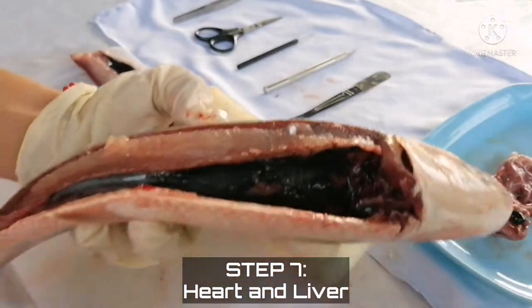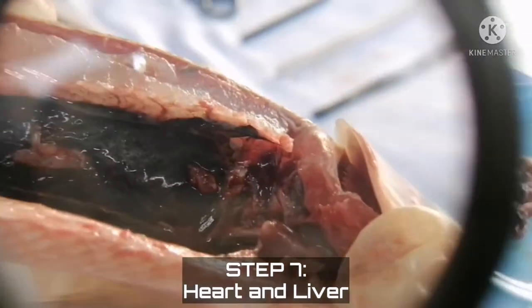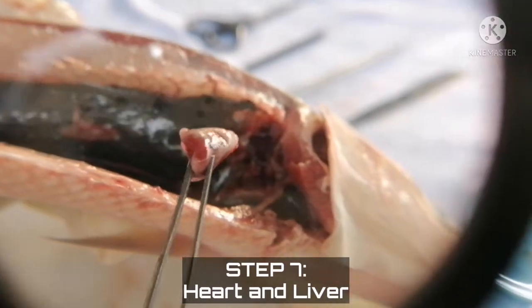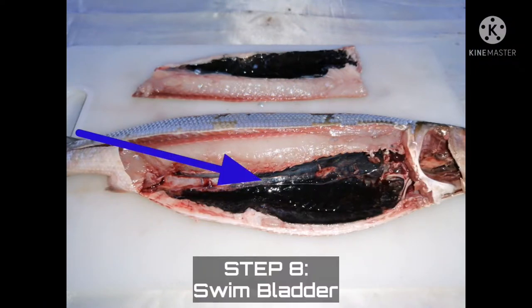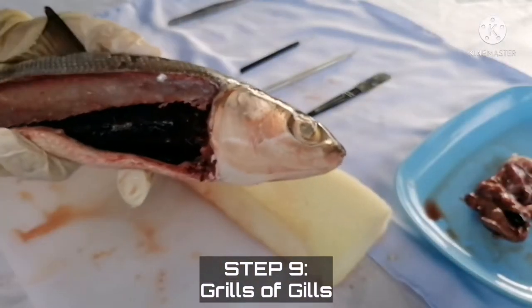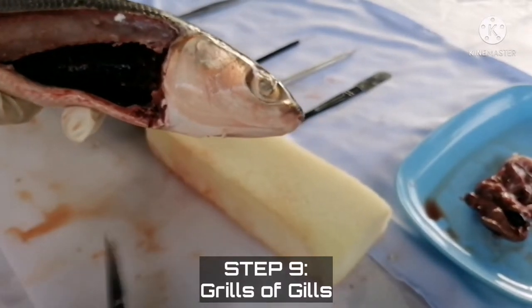Now, we need to remove the heart of the milkfish that is located under its gills. And this is the swim bladder of the milkfish. Now, we need to cut this part of the head to reveal the gills of the milkfish.